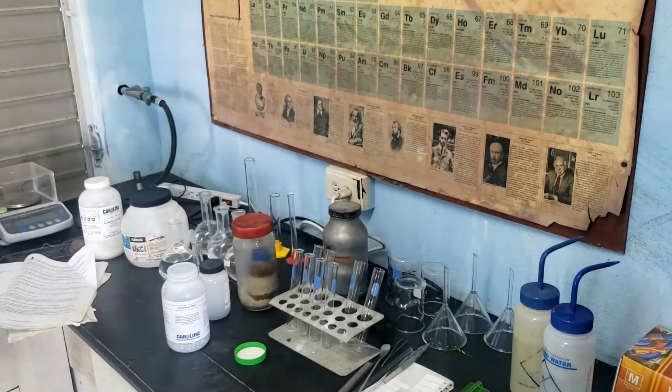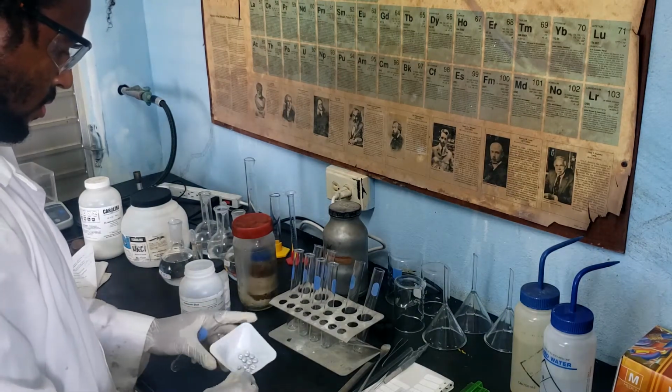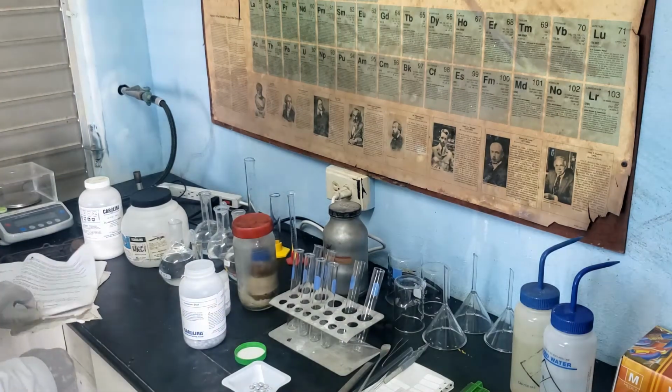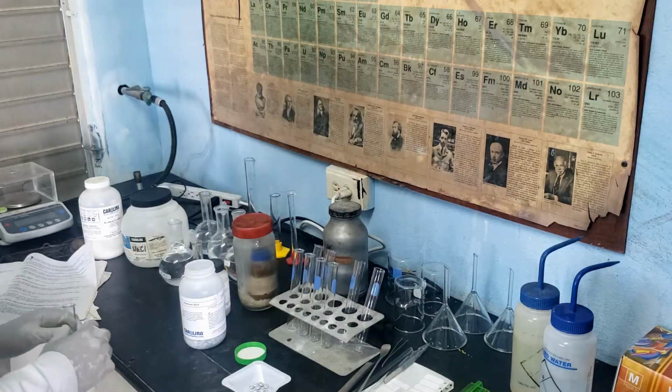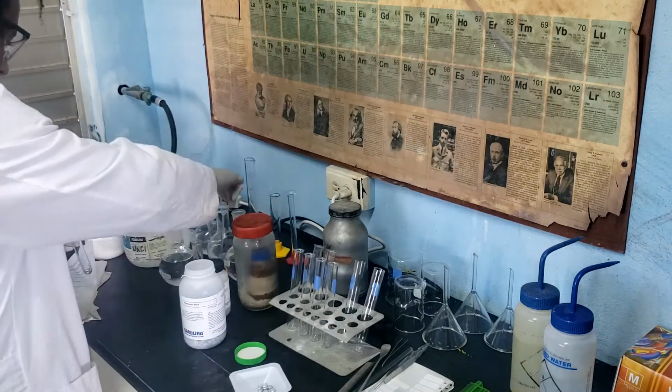Because aluminum contains a very thin oxide layer around its surface, it is often misconceived as unreactive. The following experiments attempt to explore the reactivity of aluminum as that oxide layer is removed.